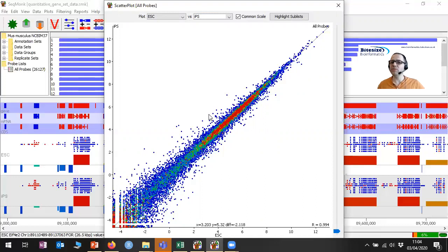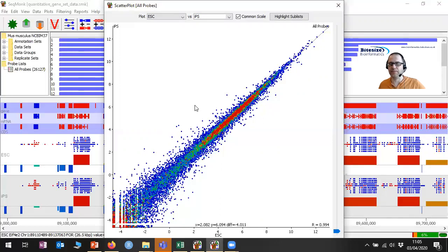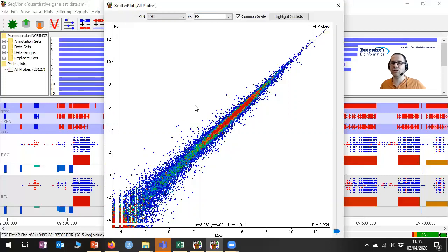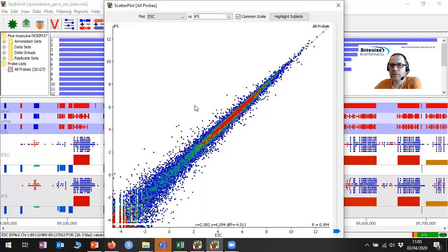That can work really nicely, but sometimes it doesn't. The cases where it doesn't work are: firstly, sometimes you won't find any genes changing enough to be picked out as differentially expressed. Statistical tests like differential expression are always a function of statistical power. Sometimes the changes are relatively subtle — maybe you've got a mixed population of cells and changes are happening only in a subpopulation, so the effect on the total signal is small. Or the changes are quite big but not consistent across replicates, so you have a lot of variability. Under those circumstances, you don't have enough to do the categorical enrichment.